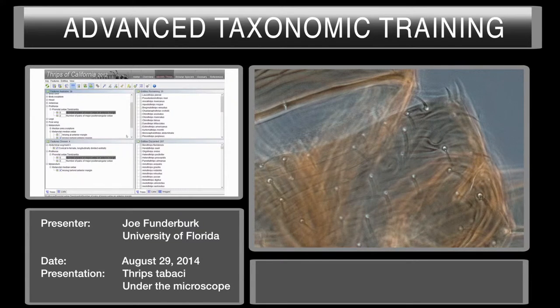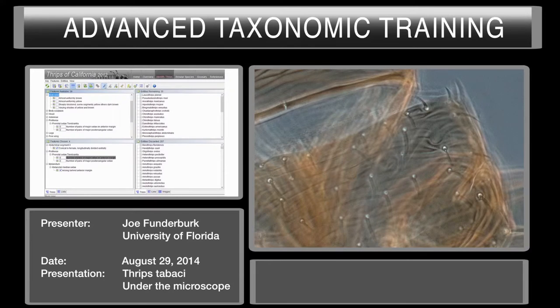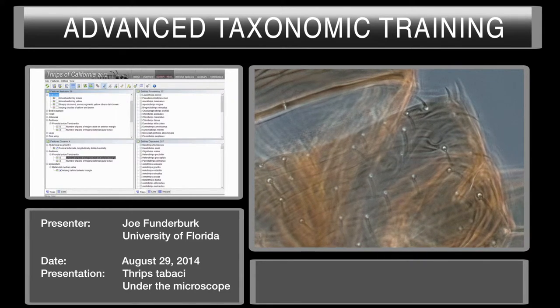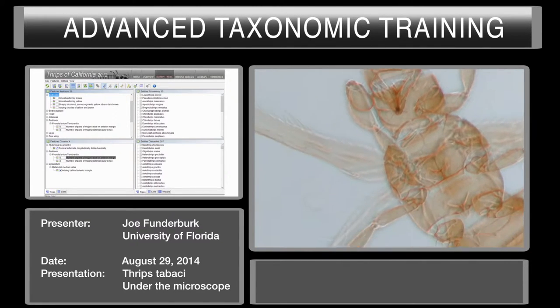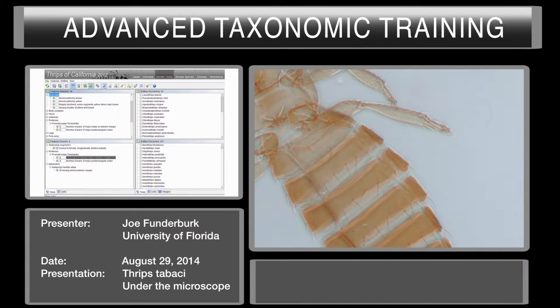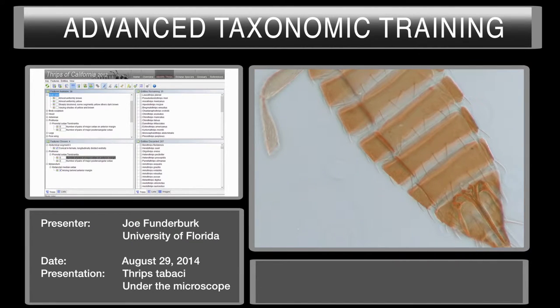Now we have 35 species remaining in the key. I'm going to choose the next best character to identify, and it's asking body color. I think it's quite obvious that it's uniformly brown. One has to be very careful with material that has been soaked and cleared, but this one is quite obviously uniformly brown.